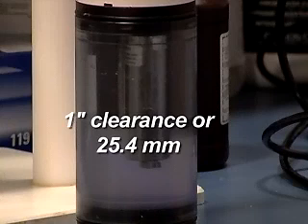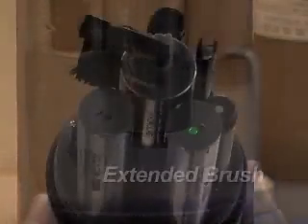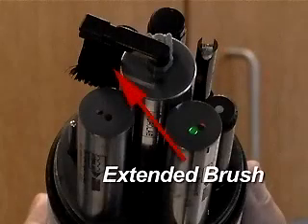To keep the optics clean, there is a motorized pad that can be set to wipe from 1 to 9 times before taking a measurement, depending on the degree of sensor fouling expected. The X version also features an extended brush for removing debris from the other sensors.